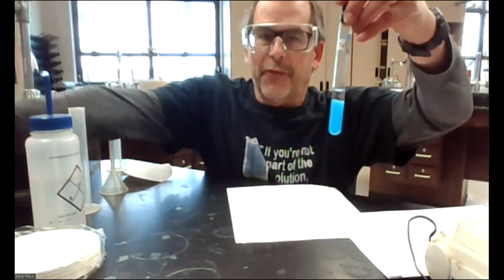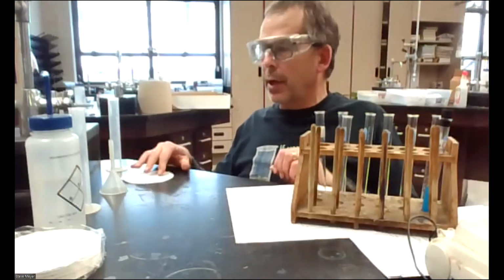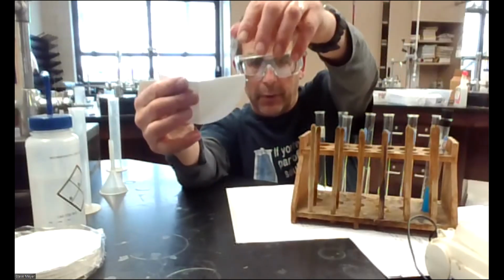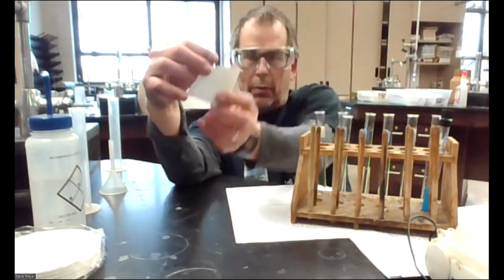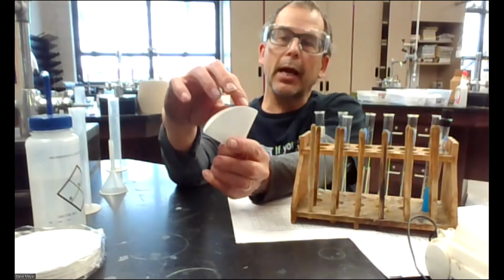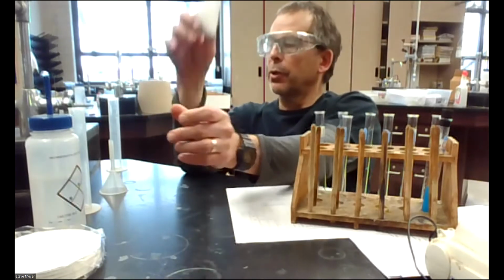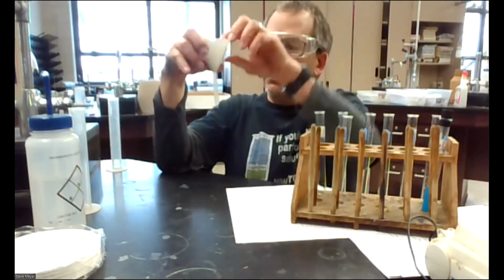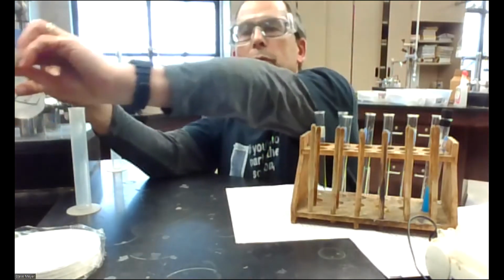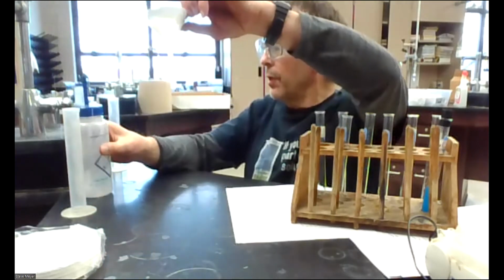Okay, now I need to filter this, and what I want to do is collect the solid in there. So I'm going to grab a filter paper and fold it in half, and fold it in half again. Okay, door number 1 is a good option. Door number 2, not so good. It'll just go through. Door number 3 is a good option. So you look at that, you get a funnel, take just a touch of distilled water, kind of get this wet around the edges. Sorry, I should have done that here so you can see it. Trying to do that over the sink.